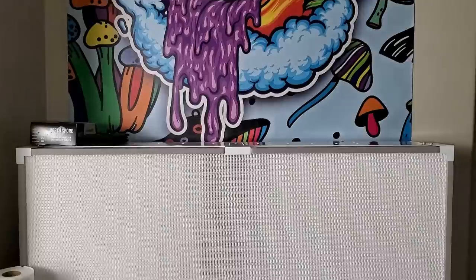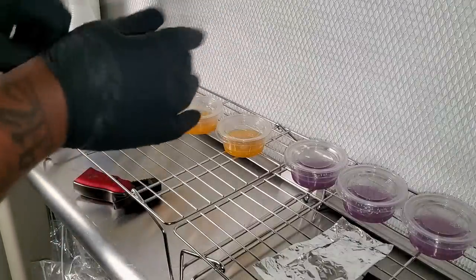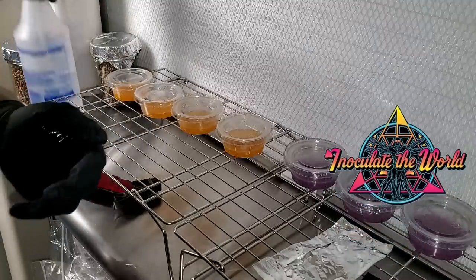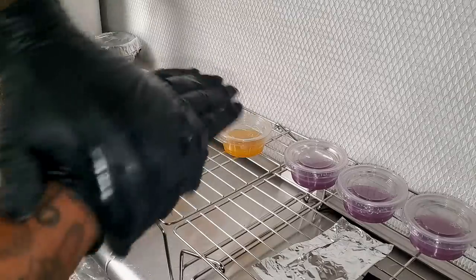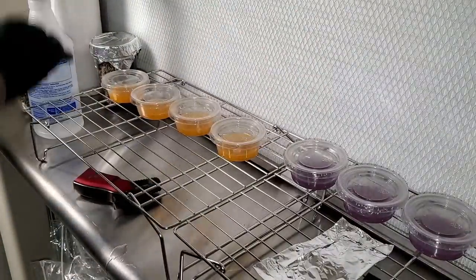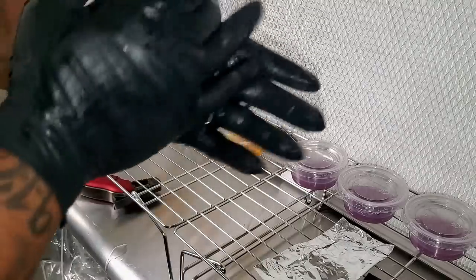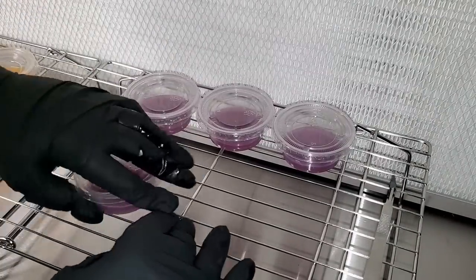As always, I sprayed my gloves with 70% iso alcohol, sprayed the table and wiped it down. The first thing you're probably noticing is I'm not in a still air box anymore — I'm in front of a flow hood. This is a 4x2 Inoculate the World flow hood. If you're in the market for a flow hood I recommend getting it from Inoculate the World — they have different sizes available. I will be doing a dedicated video on the flow hood. The still air box did work great for me, but it's hard to see what you're doing inside it and hard to get great-looking footage.